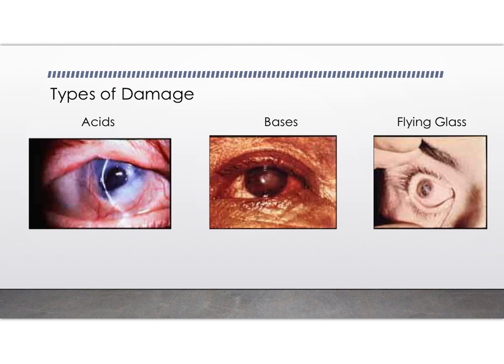Because we're working in a lab, you're going to be exposed to different types of chemicals or equipment, and you need to be sure or be aware of what they can do if you don't wear any of the protective personal equipment. If you get acids or bases in your eyes, it could definitely cause some damage, if not blindness. Or if you don't wear goggles, if something happens to break or fly off and it gets into your eye, you can also cause yourself to go blind. This is only a few pictures. There are many more pictures of what the chemicals or equipment can actually do to you if you're not careful. So I would advise going to a lab, having that safe environment, be aware of your surroundings, and make sure you don't horseplay.